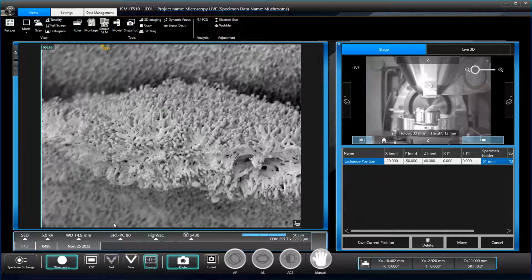So it keeps track of what you were doing. So if you ever put it in a paper, it's just a nice way to show off how you did it. Because there's nothing worse as an electron microscopist than reading somebody else's paper, and they say they did electron microscopy, and then having no idea what they did. The scale bar is also saved onto it.